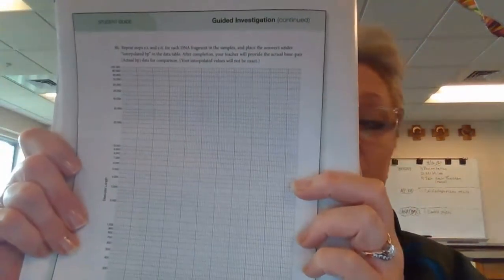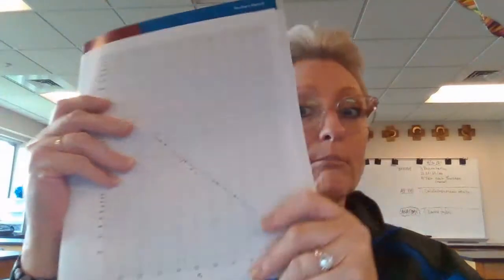So using the RF factor also, you're going to have both of these numbers: the base pair length, and you're going to have the RF. And then you just plot those on this graph right here. When you finish that, you're going to have something that looks like this. So let me show you what this is.